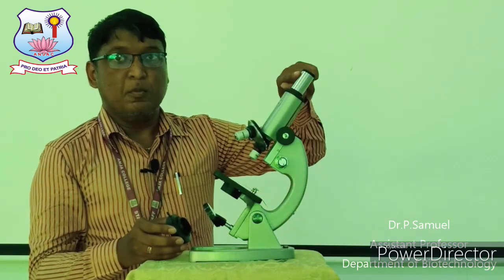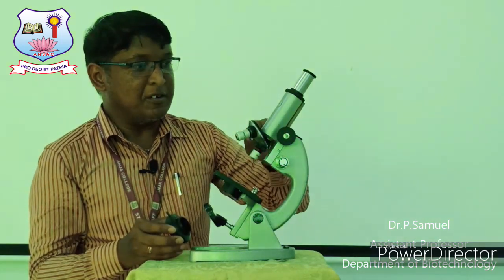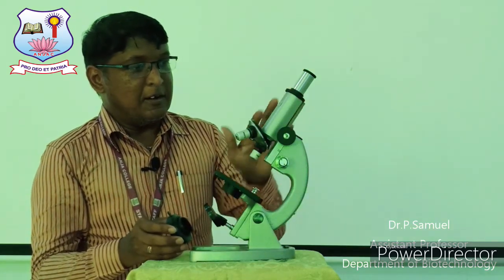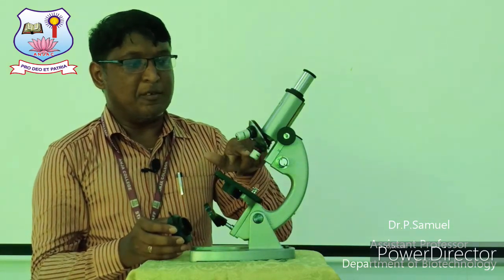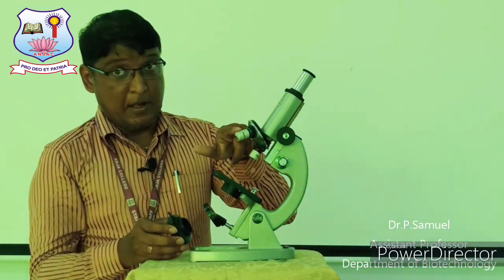body tube. This is hollow in nature, which means nothing is present between the objective lens and the eyepiece lens. And the objective lens is otherwise called the nose piece lens, and the nose piece contains three different types of magnifying lenses: low power, high power, and oil immersion.